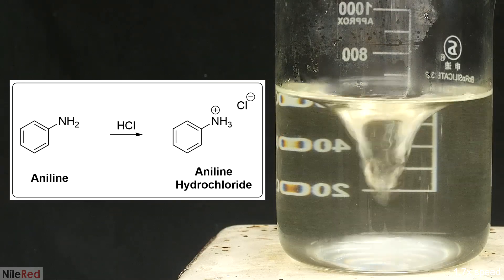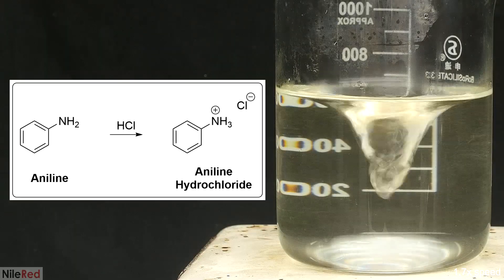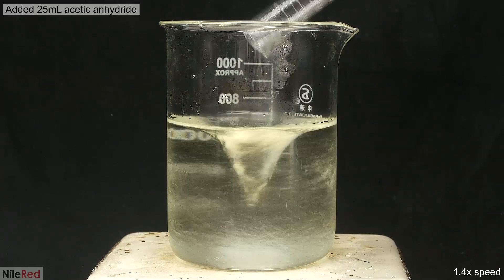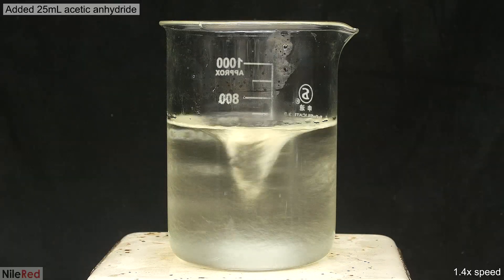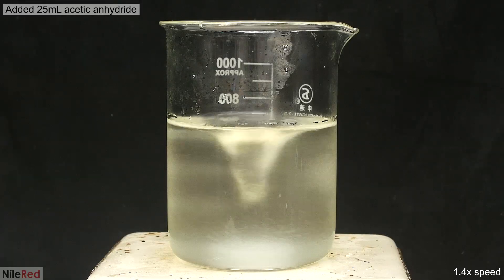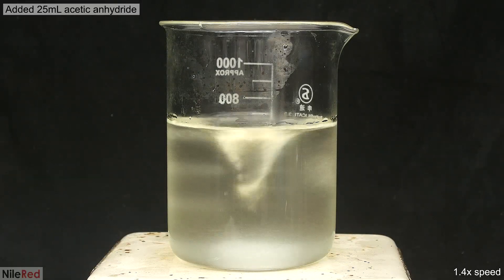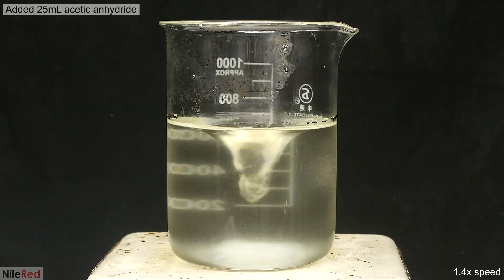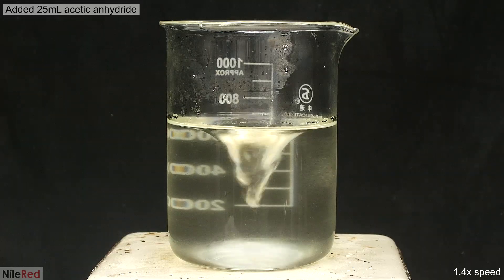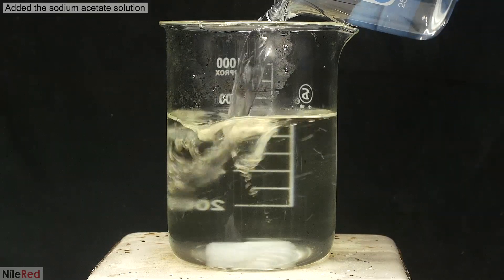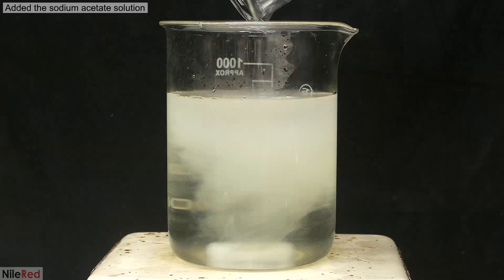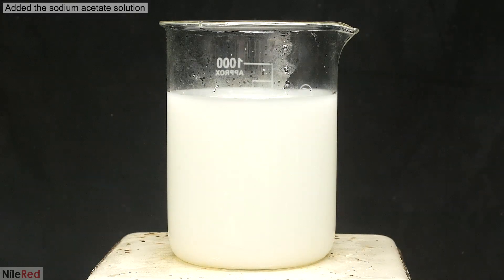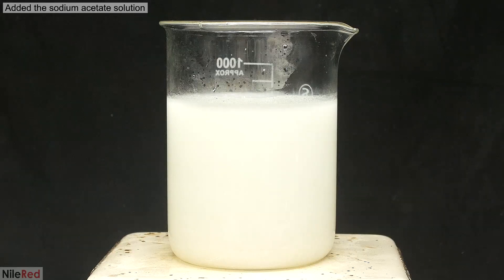When it does, I should be left with a completely clear solution. With everything dissolved, I then dump in the acetic anhydride. The reaction is quite quick, and it's more or less done within 30 seconds. However, nothing precipitates out, and all of the product is still dissolved in the solution. To get it out, I dump in the sodium acetate solution from earlier. Almost immediately, a whole bunch of acetanilide falls out of solution.